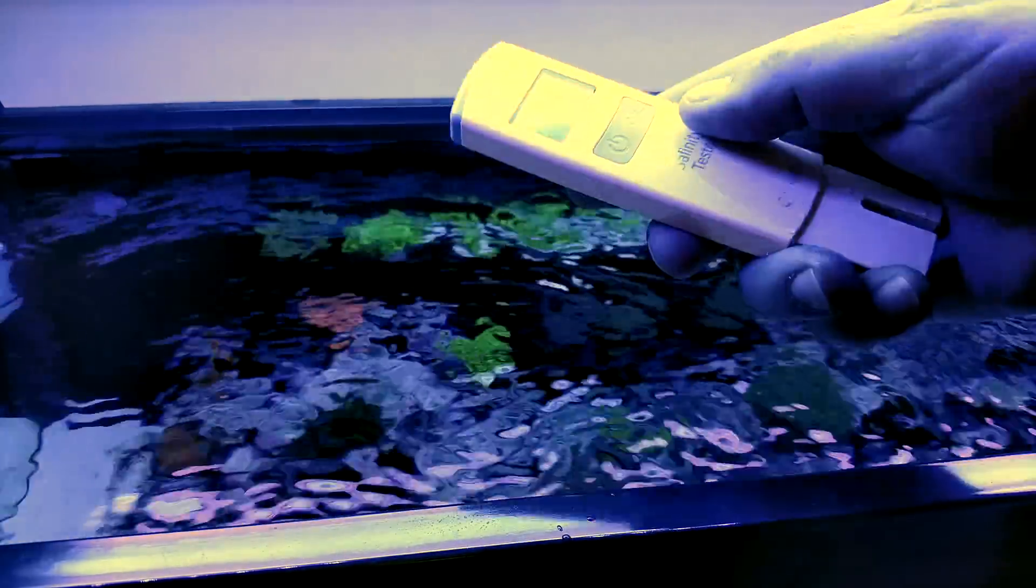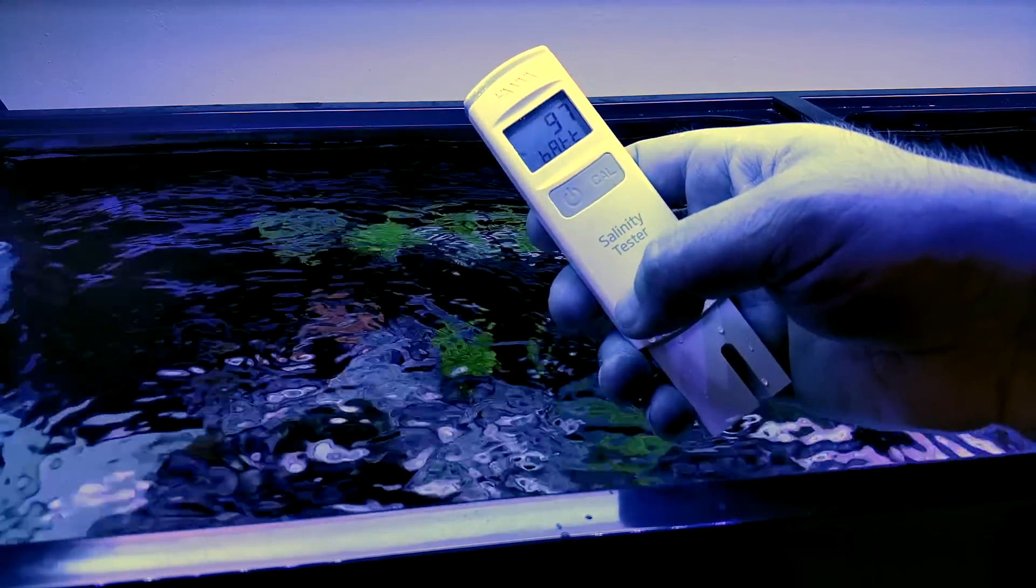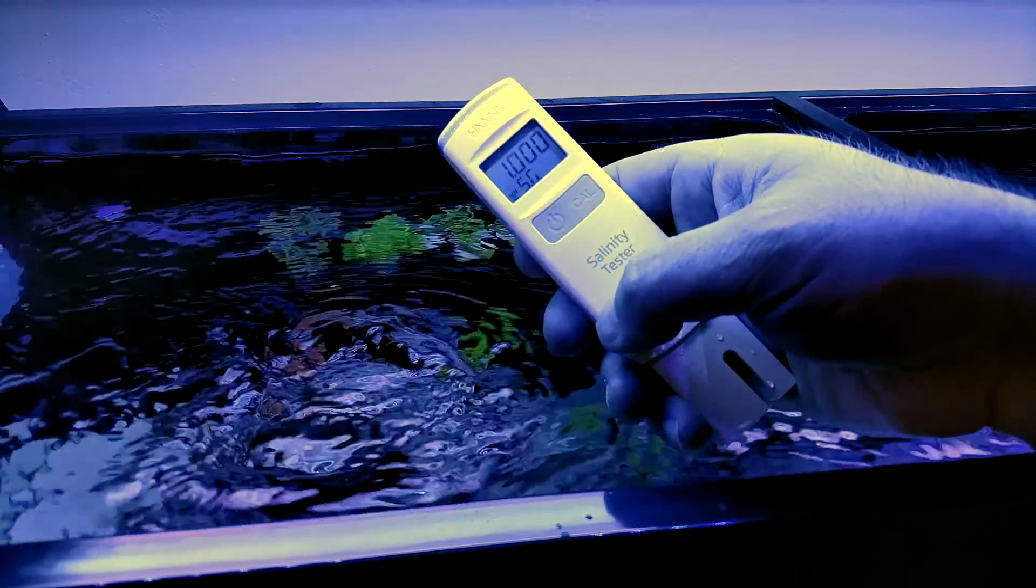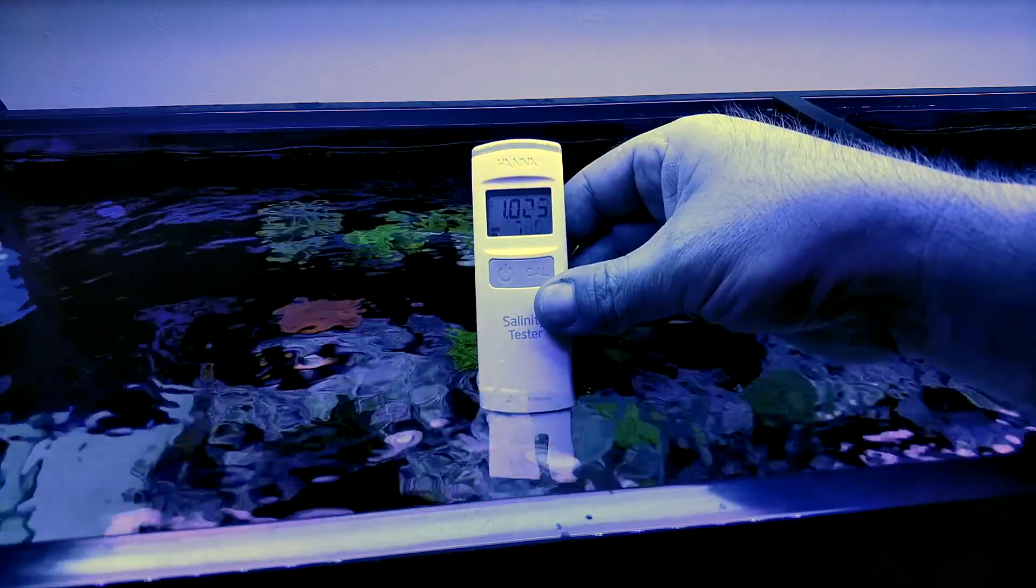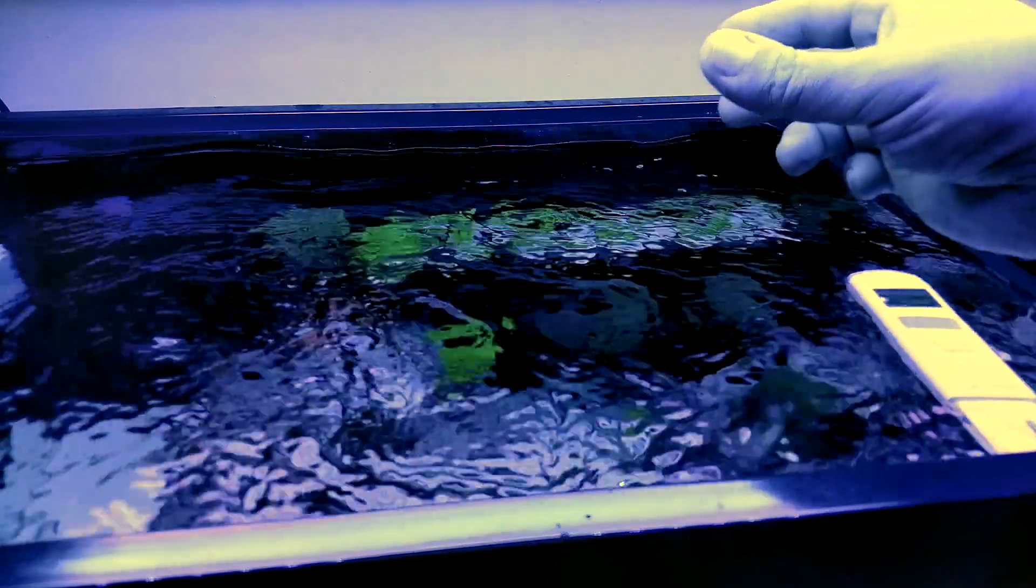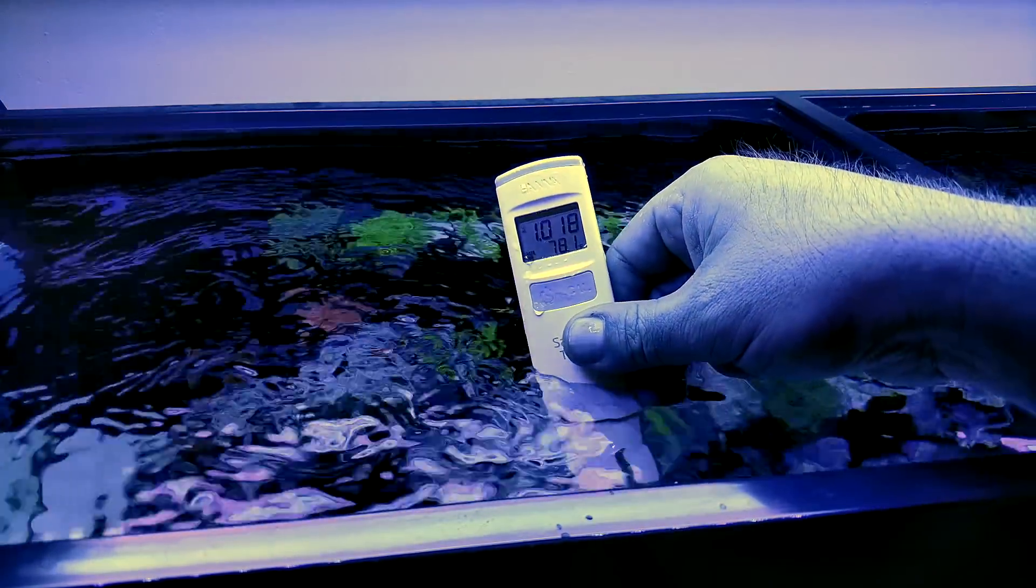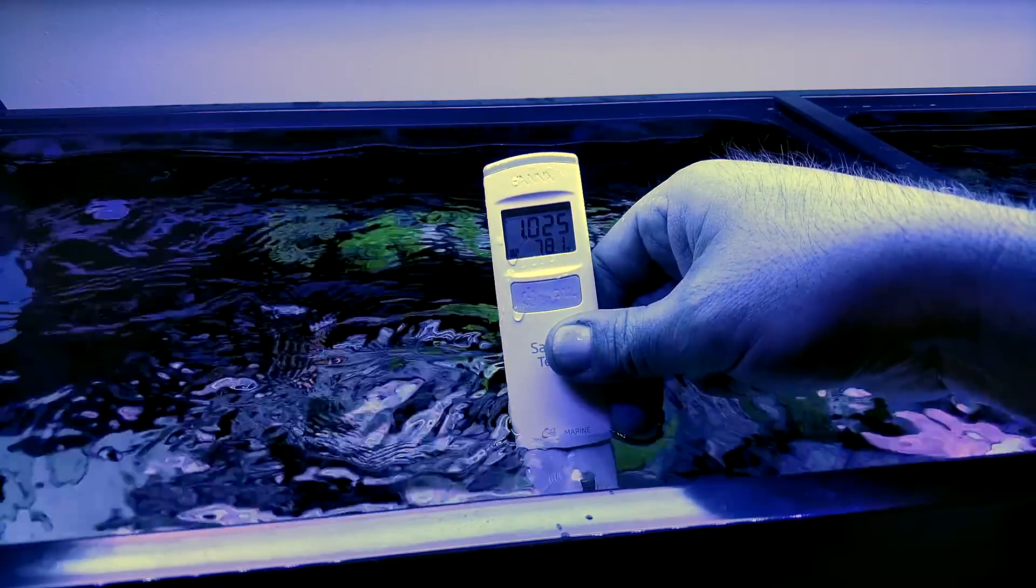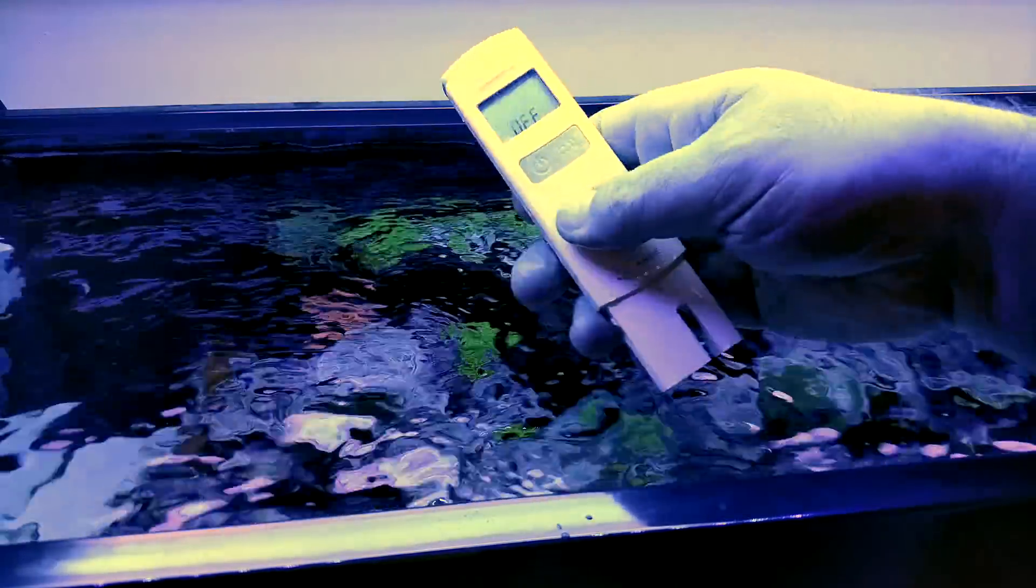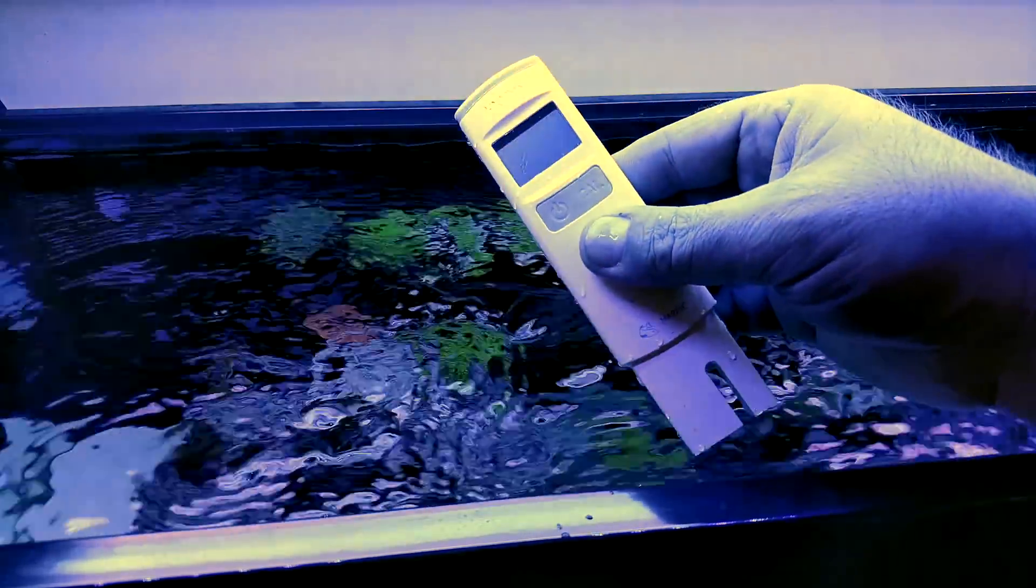So that's it. Hanna. Oh, and just for a little bonus, check it out. 97%. And there it is. There it is. Oh no. There it goes. Just kidding. It's waterproof. It's waterproof. Refractometer's not looking at it. 1025, 78.1. All right. I love this thing. I'm going to rinse it off, dip it in some RO, and store it.